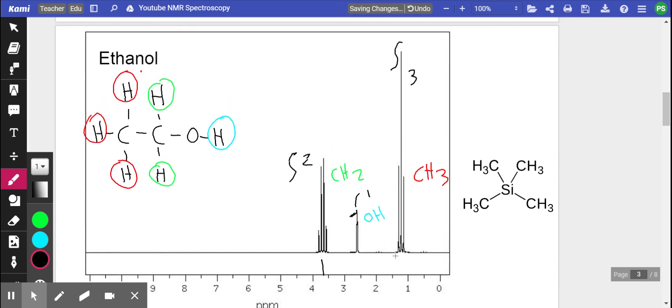So using the data booklet and where the peaks are, you can identify functional groups that are present and you can identify how many of each hydrogen there are. For example, if we integrated this peak of OH and we found two, that would mean there's two alcohol groups. In this case there's only one because it is ethanol, it's not a diol.